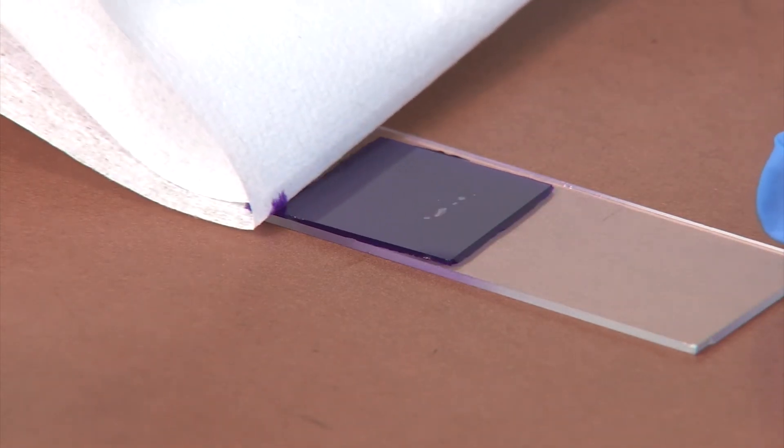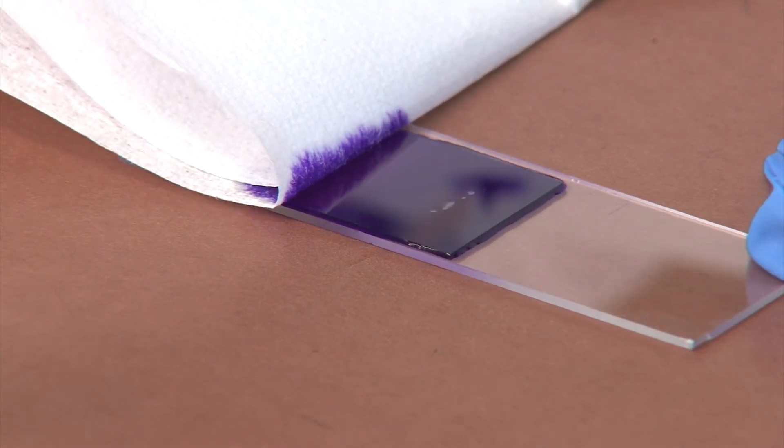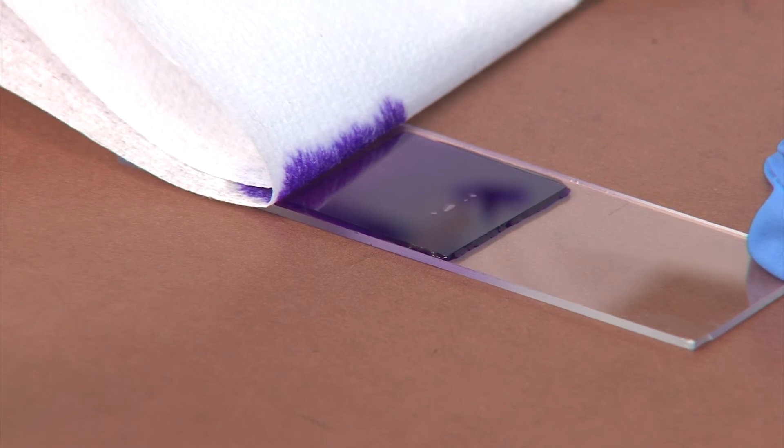If there is too much water and the cover slip is floating, touch the edge of a paper towel to the edge of the cover slip. This will absorb excess water.